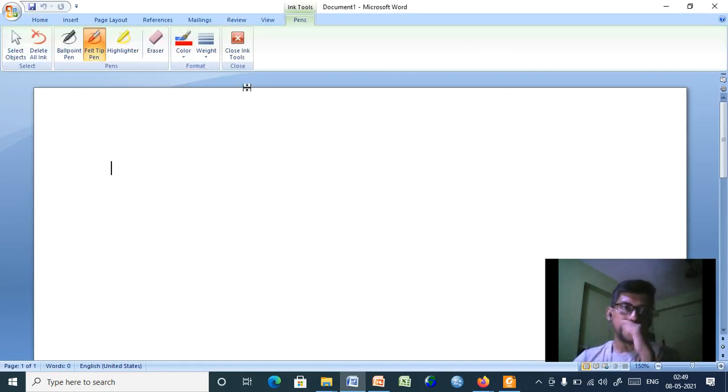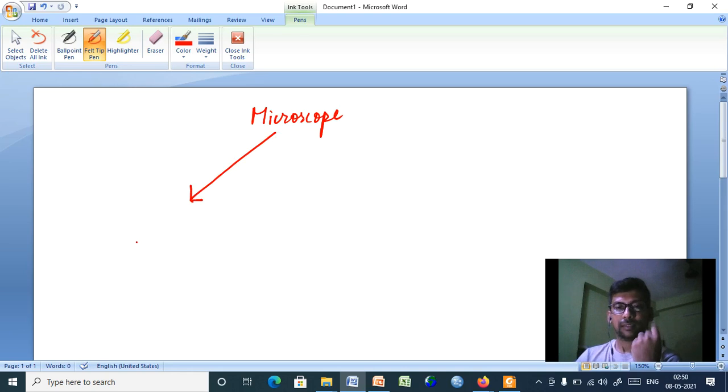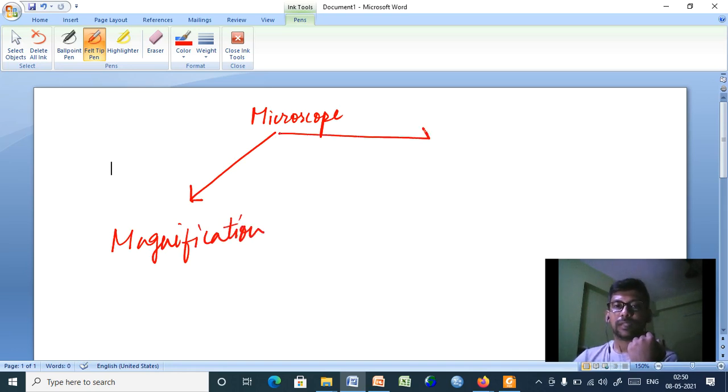So what are they? A microscope has the property of magnification. It has a quality of resolving, resolving power.